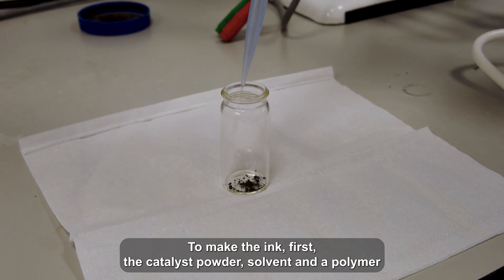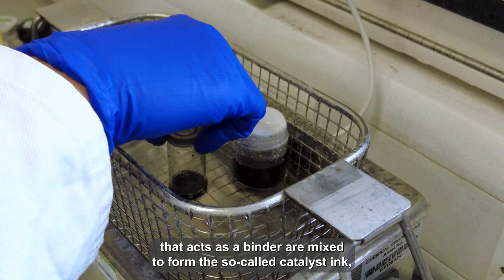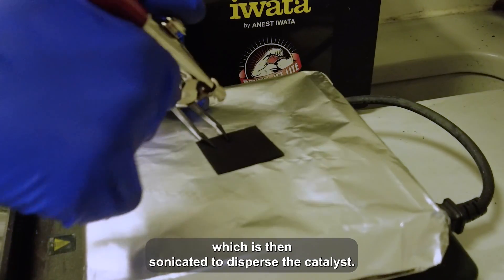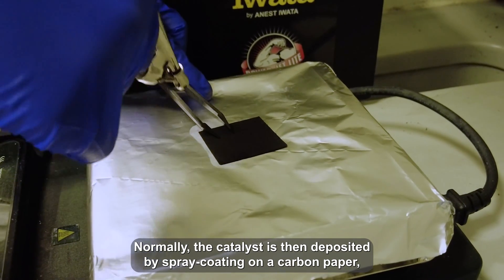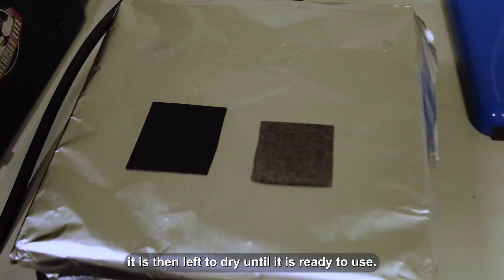To make the ink, first the catalyst powder, solvent, and a polymer that acts as a binder are mixed to form the so-called catalyst ink, which is then sonicated to disperse the catalyst. Normally, the catalyst is then deposited by spray coating on the carbon paper. It is then left to dry until it's ready to use.